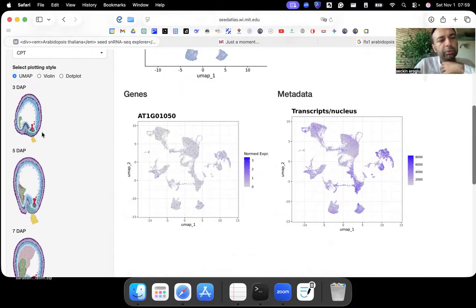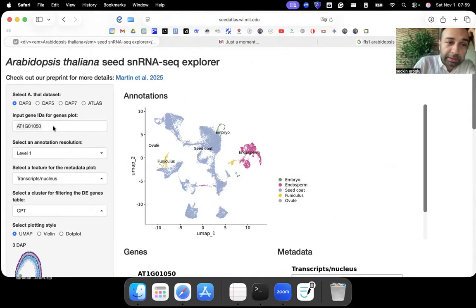How they do it, I'm not exactly sure. There should be like 2 ways, but I'm pretty sure they didn't do laser dissection. Sometimes they cut these cells with a laser, but I think here they didn't do that. What they did was they just destroy the cell walls, or even they didn't do that.